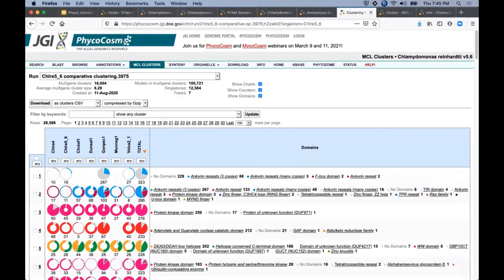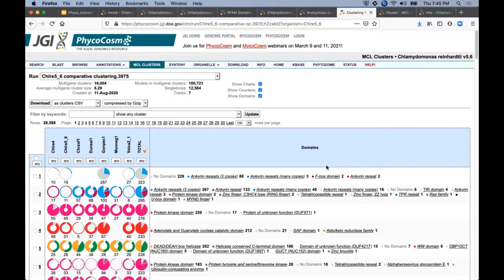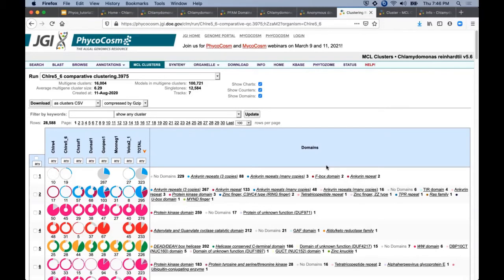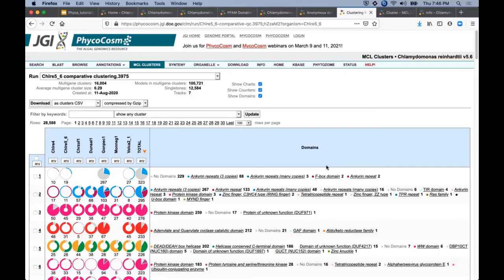Okay, I will cover two more topics. The first being our MCL clusters. We start with BLAST similarity between proteins and apply an MCL algorithm to group these sequences further into multi-gene families that share not only homology, but hopefully also predicted function. This is a powerful tool for examining similarities and differences between Phycocosm genomes.